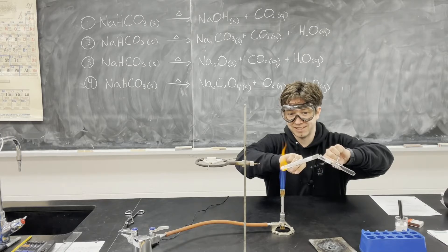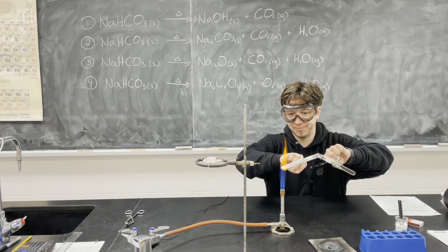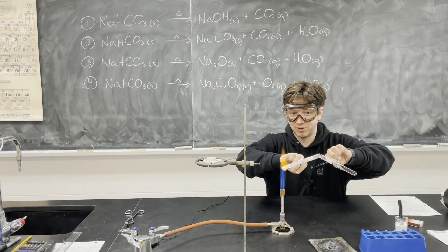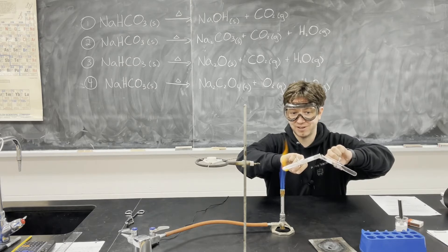You can already see some condensation, so we know there's a gas forming. And that condensation is most likely water, but let's continue to test for carbon dioxide.